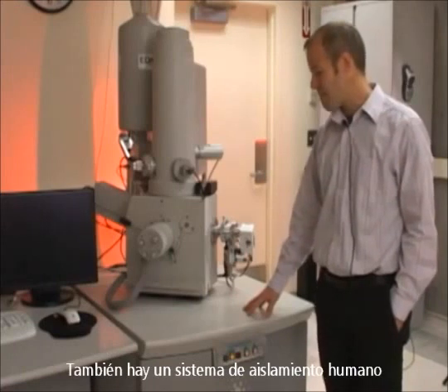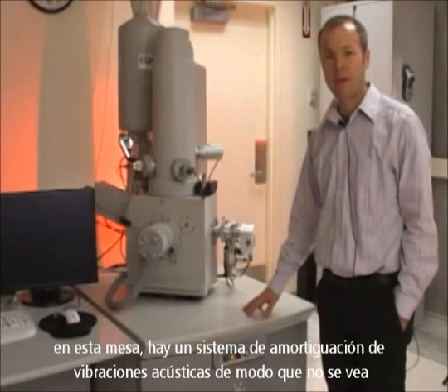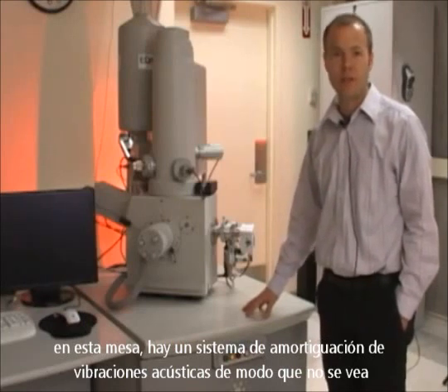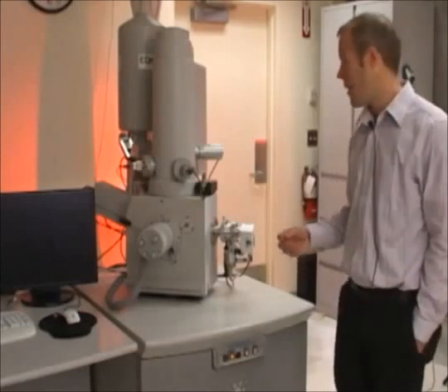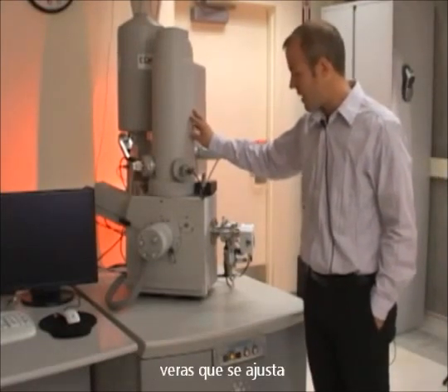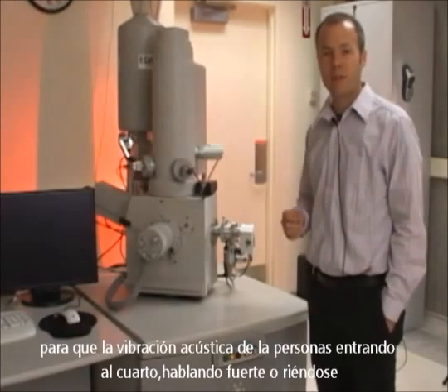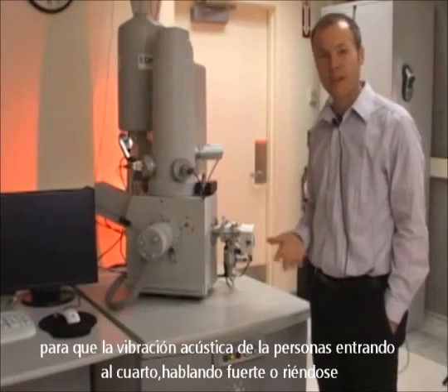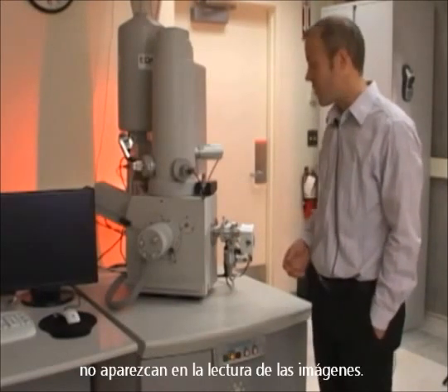There is also a pneumatic isolation system in this table to dampen acoustic vibrations, so that you don't see any small vibration in your sample while you're viewing it. If I push lightly on the column, you'll see that it adjusts. The column is floating, and that's how we dampen out acoustic vibrations from people walking into the room or talking loudly, so that those things don't show up in the image.